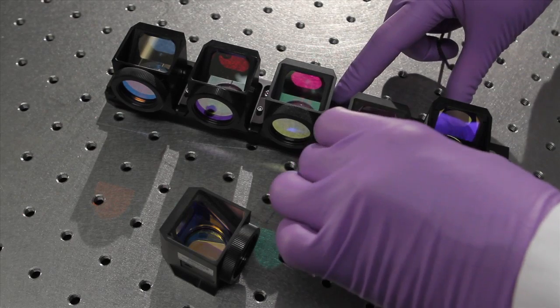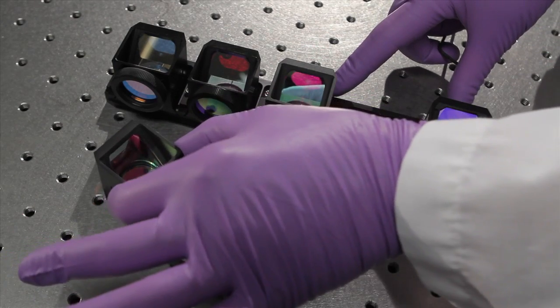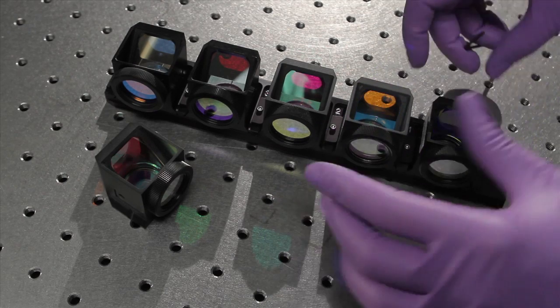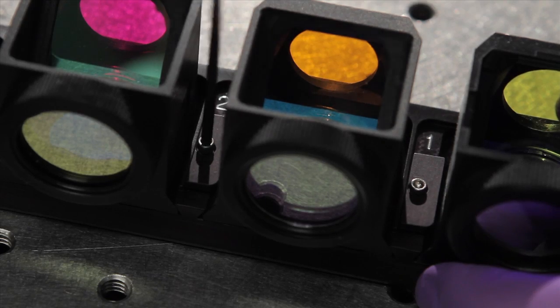Slide out the filter cube and insert the new one, making sure it is flush with the edge of the rack. Use the same wrench to tighten the screw to finger tightness. Do not over-tighten as this may distort the filters.